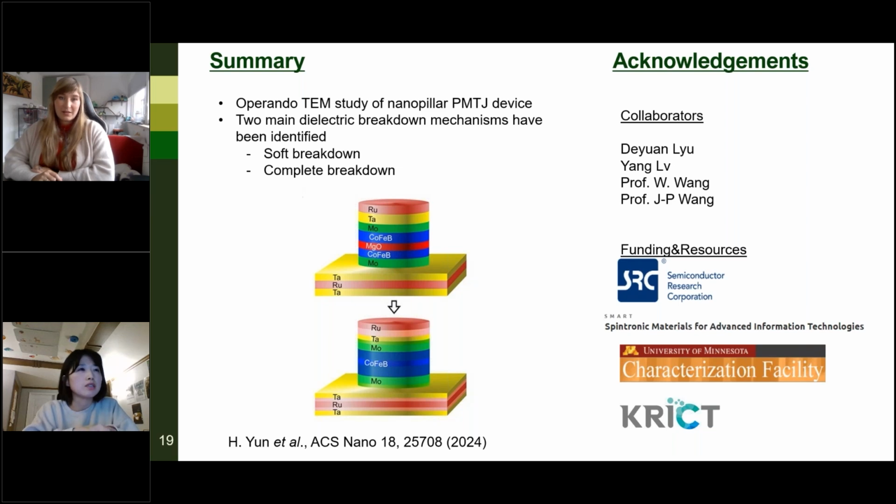I think that answers the question, but I also acquired annular bright field STEM images and bright field STEM images. In the bright field STEM images, it was more visible. In the annular bright field STEM images, I could see some lattice contrast as well, but it was not as clear as in the bright field STEM images. So I just used the bright field STEM images.